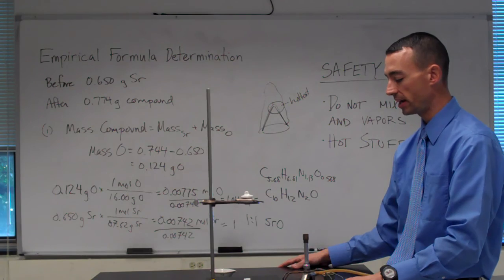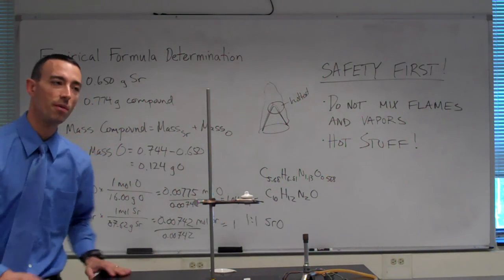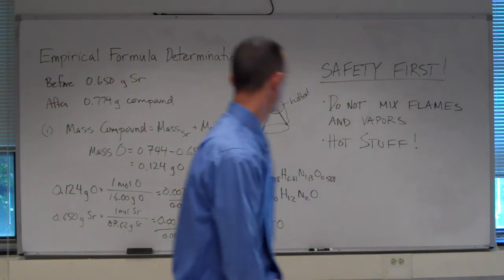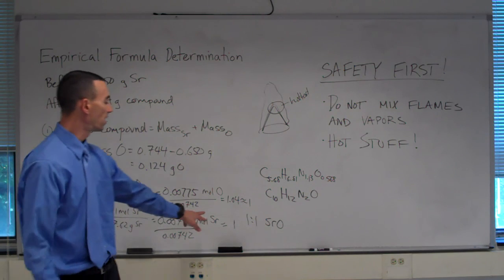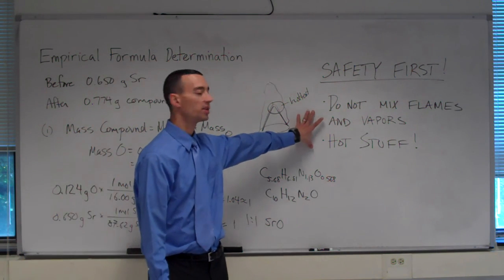But we want you to experience some of these things and learn how to safely set up and utilize this equipment for yourself. So again, I think today's goal is to find the empirical formula of your two ionic compounds, and to above all be careful while you do that.